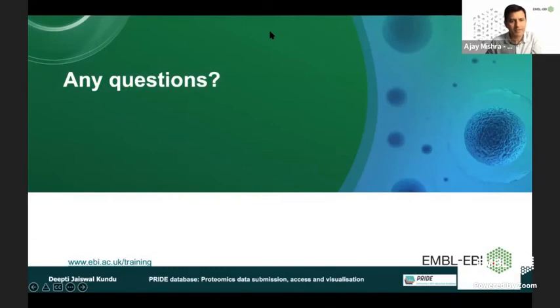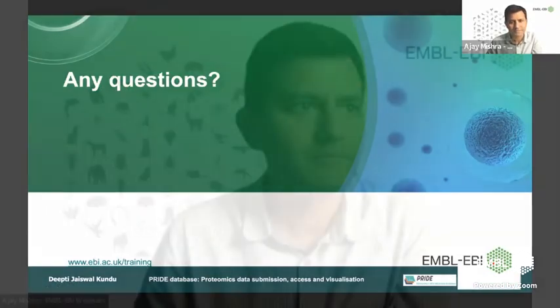If you have any questions, please type them in. While we are waiting for questions, is there any general comment, Deepti, or anything new coming up for PRIDE you would like to share? In future, we are planning to do more of these kinds of webinars, for the SDRF, because it's a new format which we have proposed. So we might do a very specific webinar only on that.